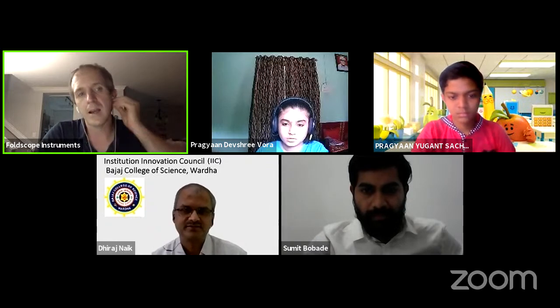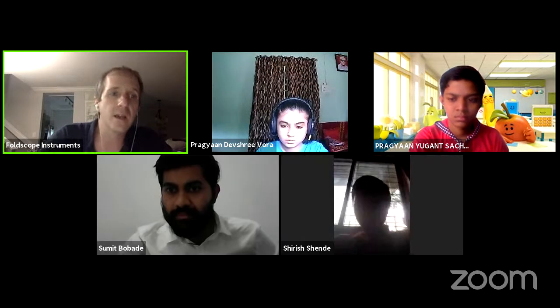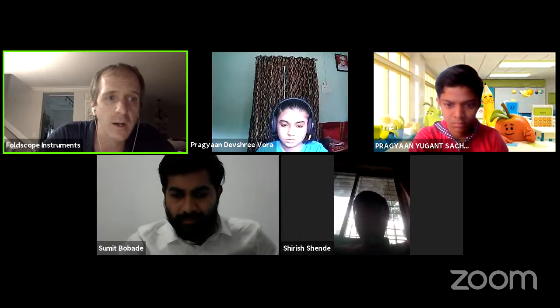Yeah, I think it's actually very possible. The main challenge would be to find a lens that's going to work for that purpose. We have a particular source for our glass beads. They have very good clarity. And I think a lot of vendors that would sell low cost glass beads would actually not have enough clarity for that purpose. So the first challenge that you would have to solve is finding a source for the glass bead. And you could get that from us and then make your own using that one solution.